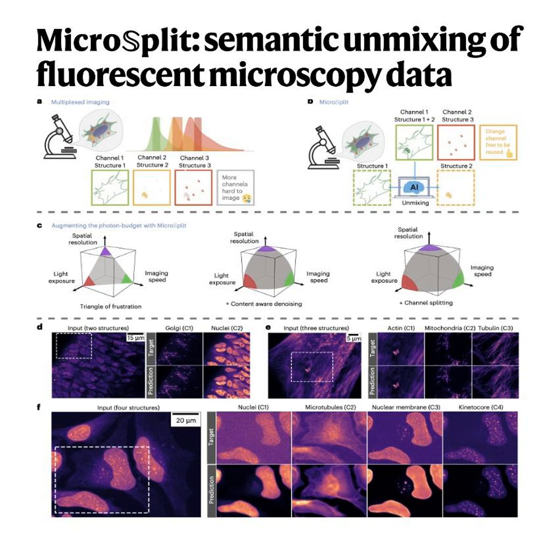It utilizes something called posterior distributions. So a standard deterministic AI looks at an image and just gives you its single best guess. Right, it just gives you one answer. But MicroSplit doesn't do that. It learns an approximate posterior distribution of possible solutions.